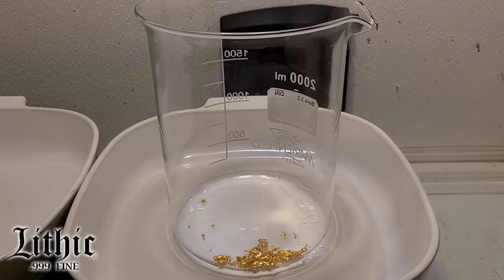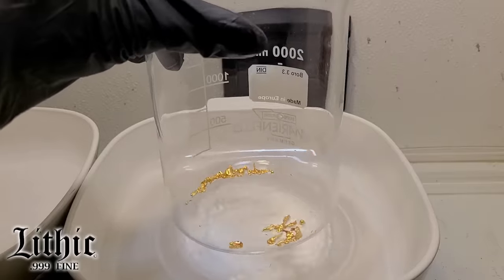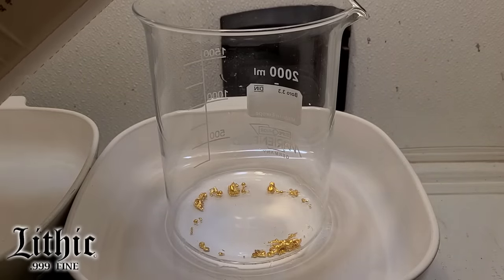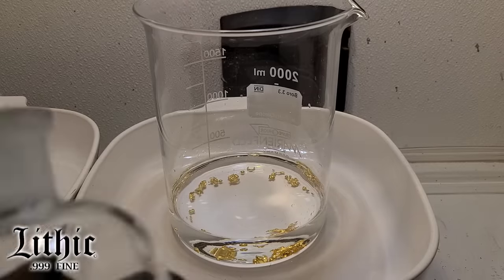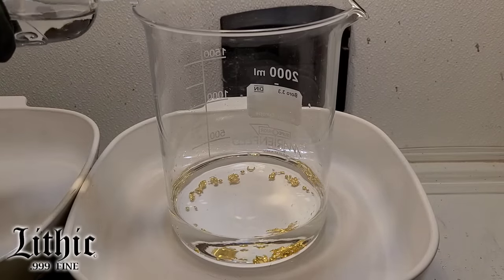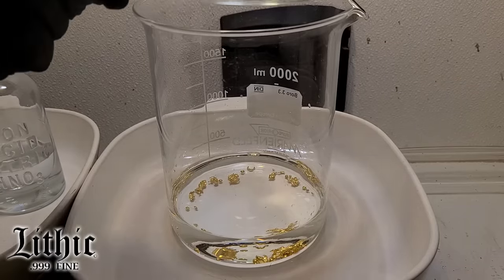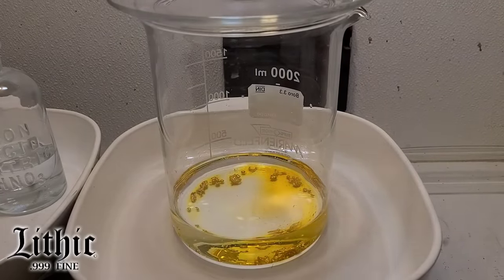I put the gold in the beaker and took a look at it to disperse it evenly a little bit. Here I'm adding hydrochloric acid, and in just a second I'm going to add concentrated nitric acid — that's going to essentially make aqua regia, and that's what's going to put this gold into solution. Pop that on, add some heat. Immediately — this is time lapse — we see this reaction going, and boom, you see that gold going into solution.